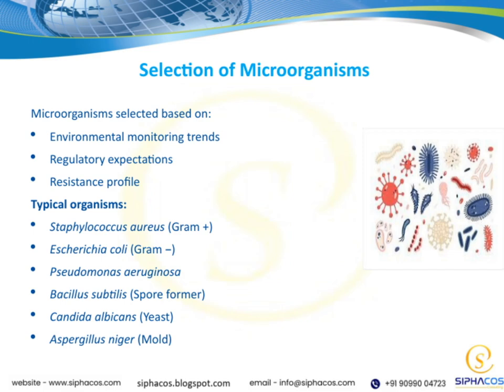By selecting this diverse group of microorganisms, we ensure our testing is comprehensive and relevant to the real-world challenges we aim to address. This approach ties directly into our overall goal of improving sterilization and disinfection processes across different environments.